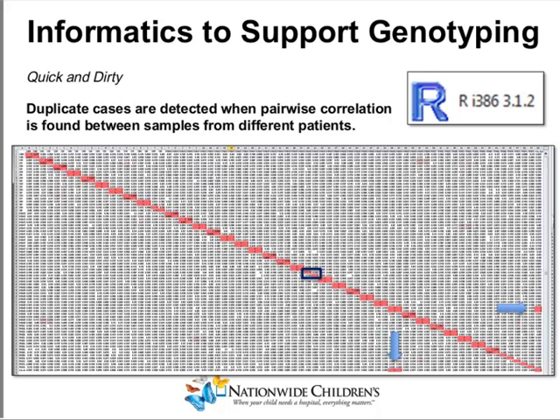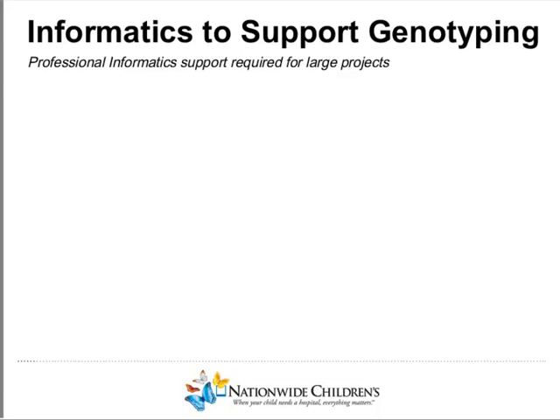You can't see it, but it says fake duplicate as a positive control for the ability to detect that mismatch, and here, detect that historical match. And here's what that looks like: it shows up as a high correlation off the center line. So, not to belabor that part too long, that's a quick and dirty approach.